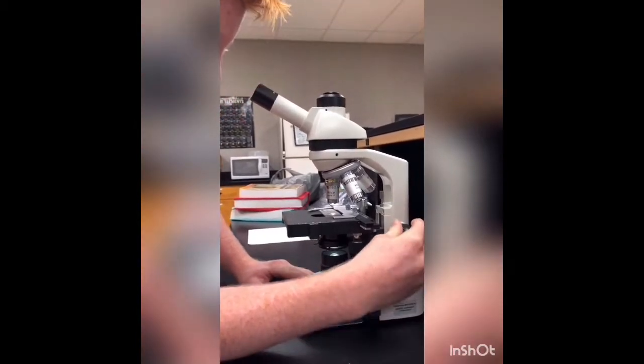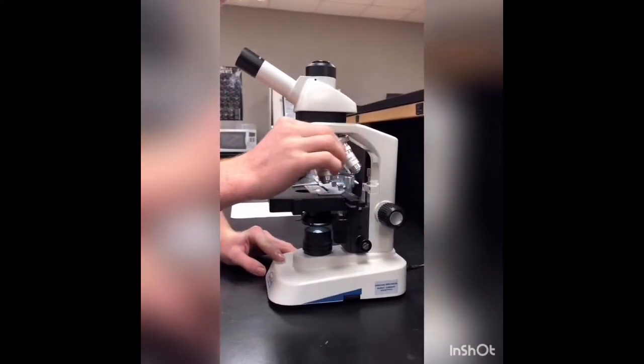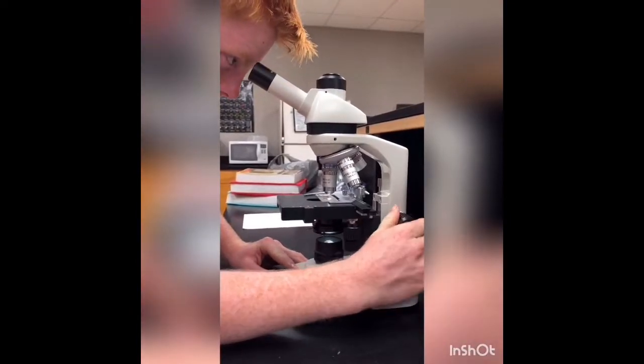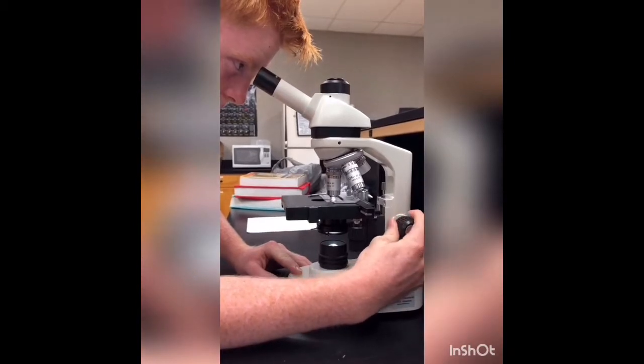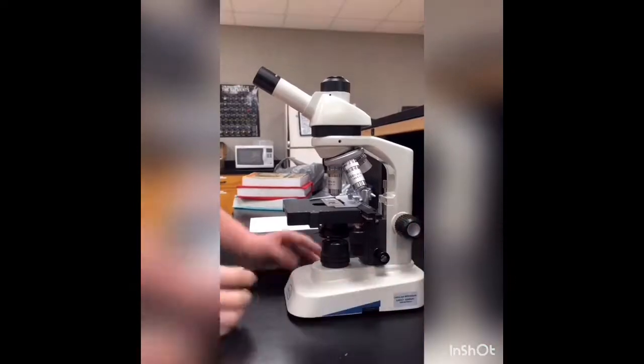Now, when you go to the next one, you go one more to the left, just bring your stage back down, and you're at the greatest magnification without using the oil, the brightest one. And then when you are done, you just simply turn the light off and put the stage back down and take your slide out.